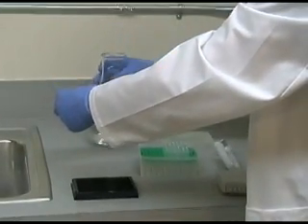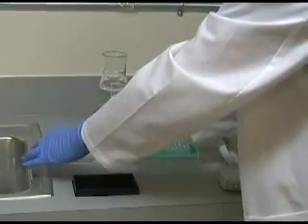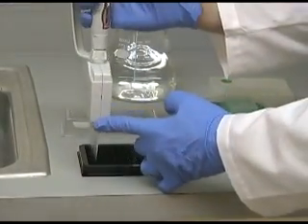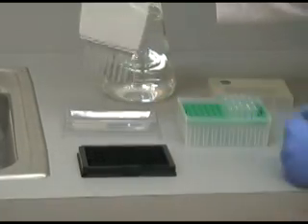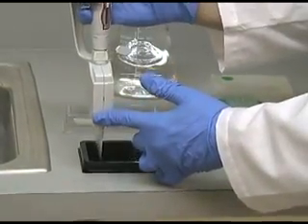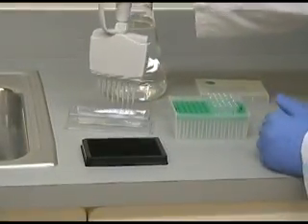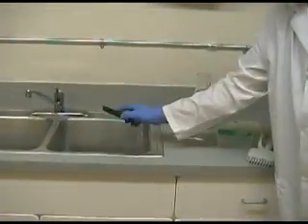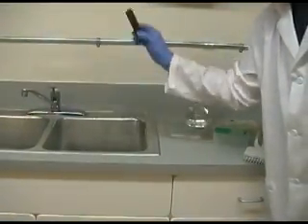Pour the prepared wash buffer into a trough or tray. Using a multi-channel pipetter, pipet 200 microliters of wash buffer into each of the wells used in the test. Aggressively flick the wash buffer out over a sink.